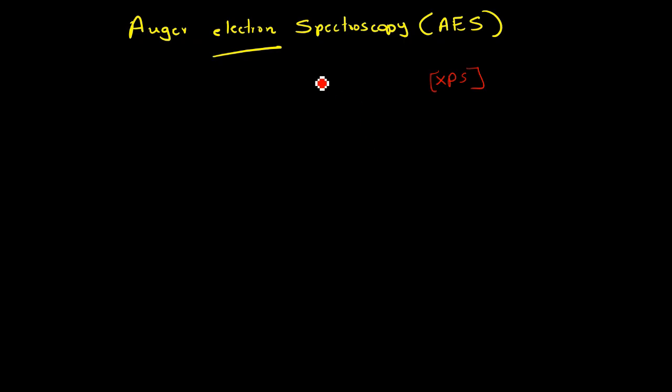In this video, let's talk about Auger Electron Spectroscopy: the principle, applications, and how to analyze the data. Now, let me go through the principle first. The principle is relatively easy compared to the XPS. Now, let's say we have a sample. Here we have a sample.